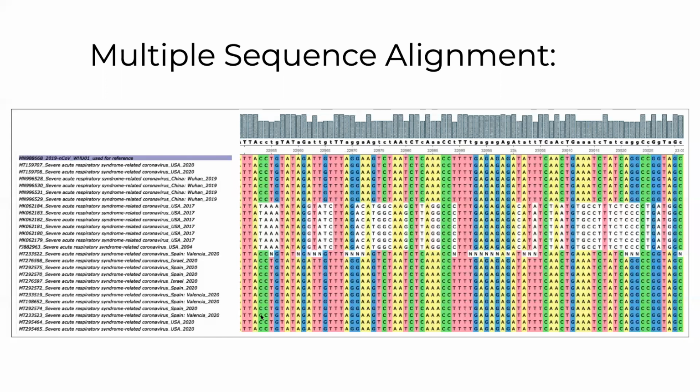So now let's take a look at this side of the picture. What do we see here? On top is the quality, right? So this could be called the quality of the sequence, of the consensus sequence. This is the consensus sequence. Or we can also call it the frequency of mutations. So we'll talk about some of these things now.